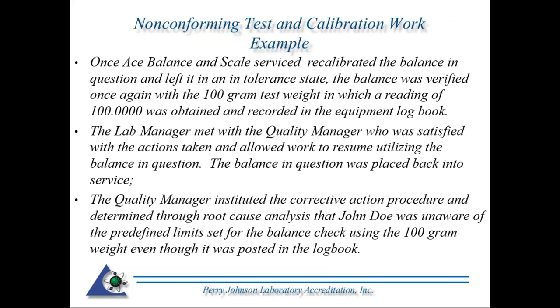Okay, moving right along with this sample, once ACE Balance and Scale Service recalibrated the balance in question and left it in an in-tolerance state, the balance was verified once again with the 100 gram weight, in which a reading of 100.0000, in other words dead on, was obtained and recorded in the equipment book. The lab manager met with the quality manager, who was satisfied with the actions taken and allowed work to resume utilizing the balance in question. Hence, in this scenario, the quality manager is the individual pinpointed as the person authorized to resume work. The balance was placed back into service. The QA manager gave his thumbs up, hence work can now resume.